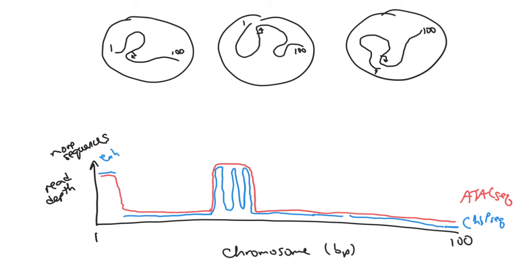So in this case, in 4C-seq, we'll see a peak associated with these regions of the genome that are close together, and that's the only regions that we're going to get sequence from. So we won't see as much sequence over here because, again, 4C-seq depends on chemical cross-linking and ligation and circularization of only parts of the DNA that are physically near each other in three-dimensional space. So we'll see that come there from that nucleus.